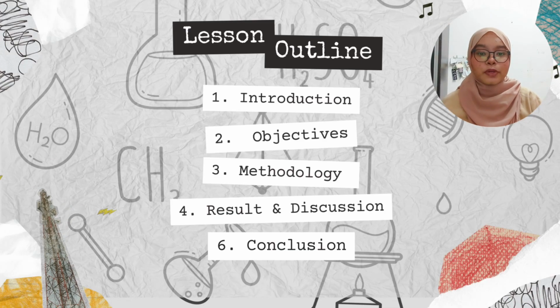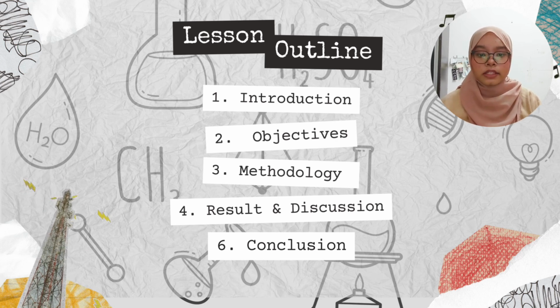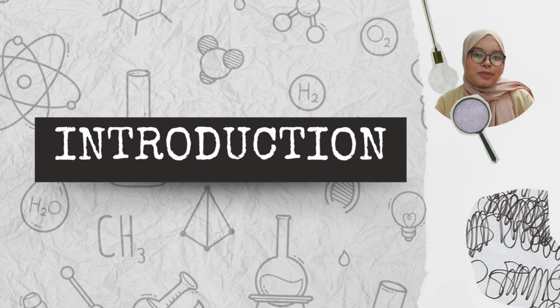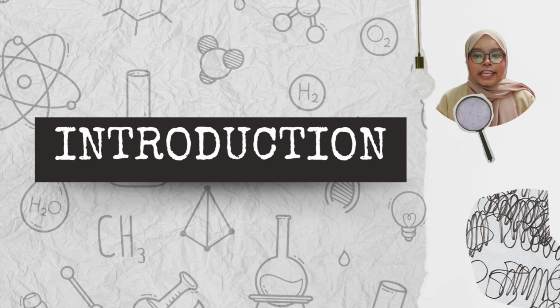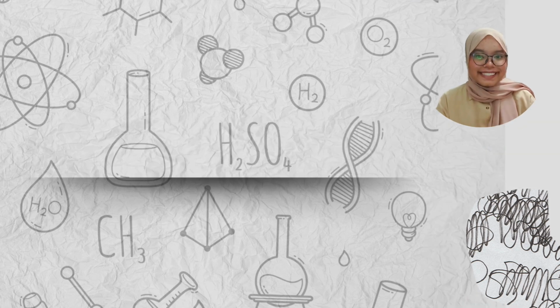In this presentation, we will talk about introduction, objective, methodology, result and discussion, and lastly the conclusion. Firstly, I will explain about introduction. In the introduction, I will explain about the definition of HPLC, key features and advantages, and lastly, the principle of operation.